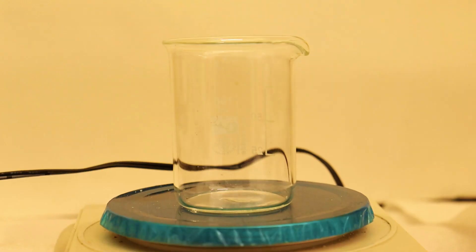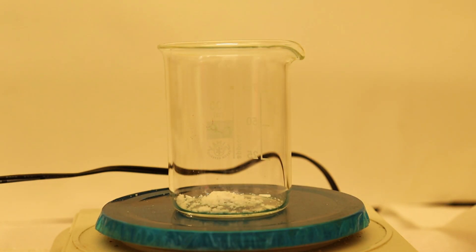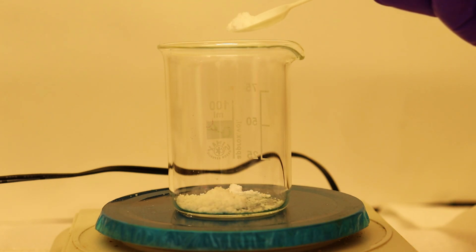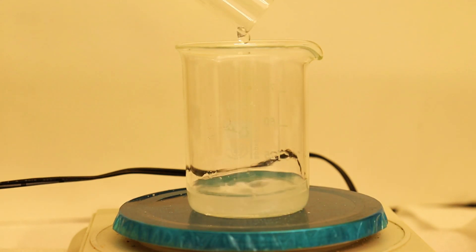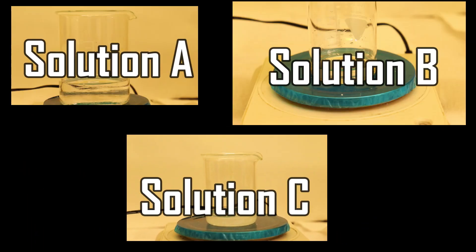And lastly solution C, which was prepared by dissolving 1 gram of sodium bromide in 10 mL of water. Now with every solution prepared we can finally do the Belousov-Zhabotinsky reaction.